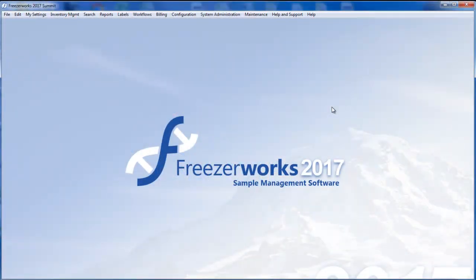Hi there. Welcome to part two of our look at the new Workflows module in FreezorWorks 2017.